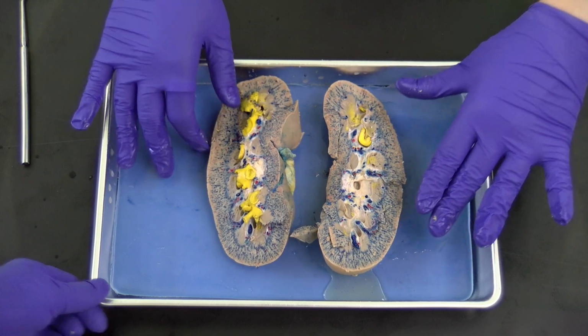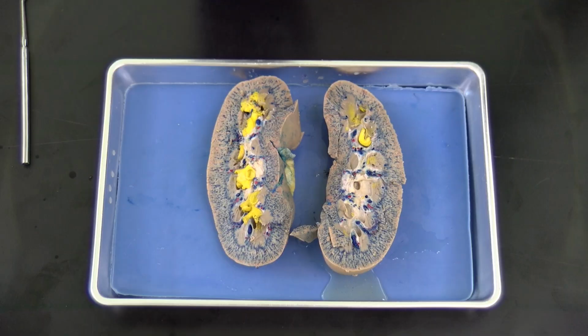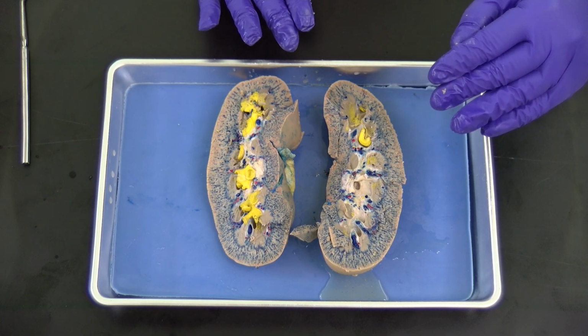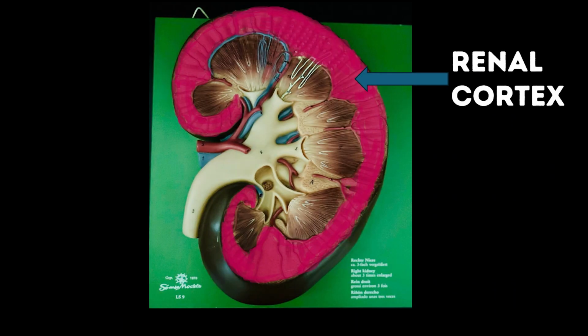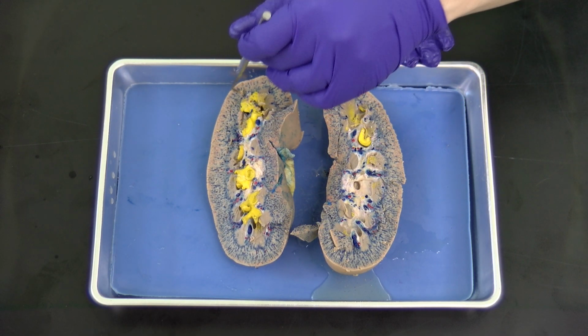Now that we are in the interior of the kidney, let's get our bearings. So there's 3 separate divisions that we want to pay attention to when we're thinking about the kidney. So in the interior here, we have our outermost cortex. The outermost cortex of the kidney is kind of shaped like a C on these sides, so you can see it kind of makes its way around.